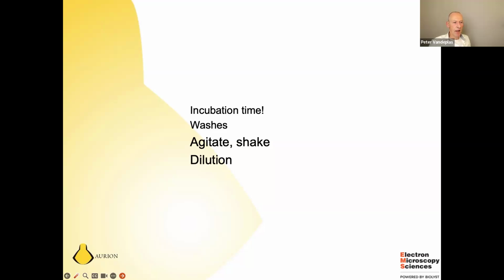the length the antibodies have to travel before they can reach the antigenic site is far longer than in comparison to a specimen that is being permeabilized with Triton X100 during fixation, where you wash out most of the cytoplasmic constituents, most of the proteins.